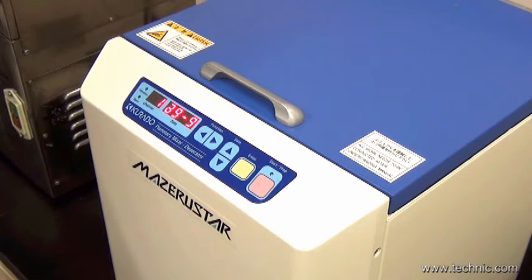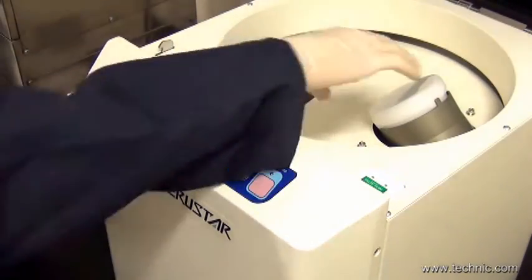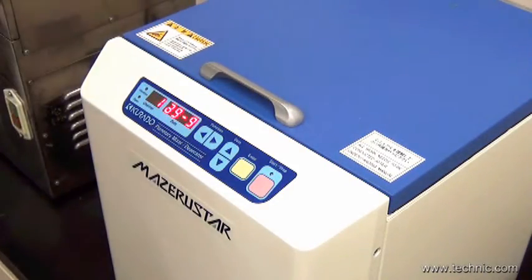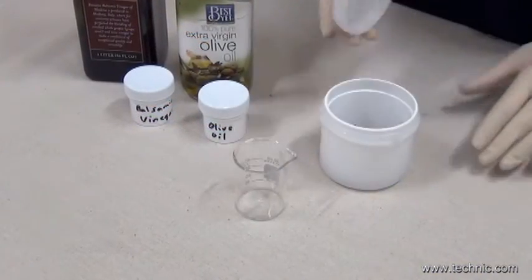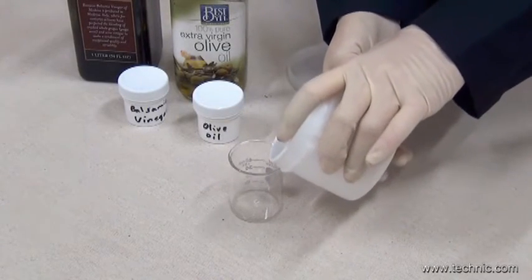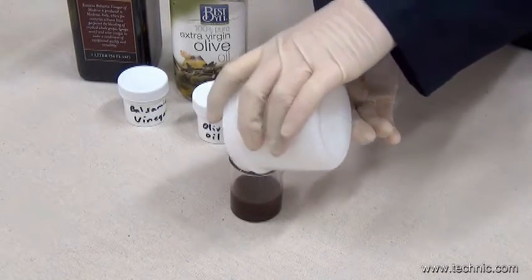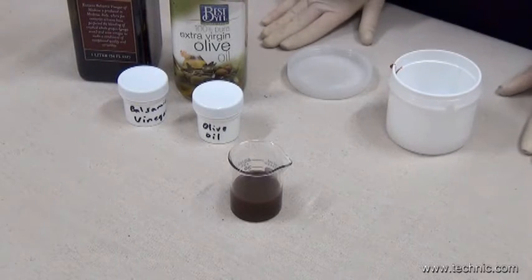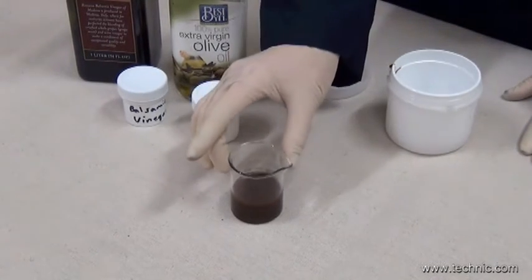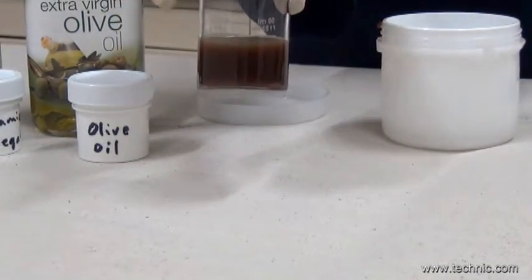Our time is up. Let's see how effective the mixing was. As you can see, the mixing is thorough. Now, we will wait one hour and see if there is any separation.